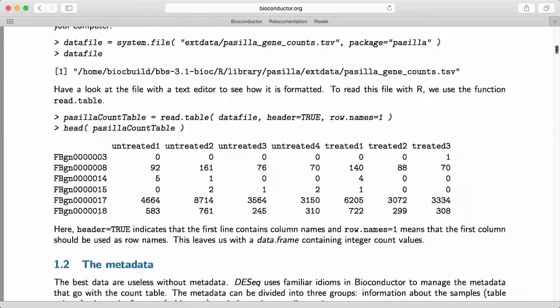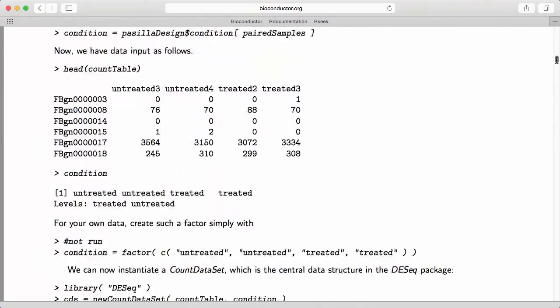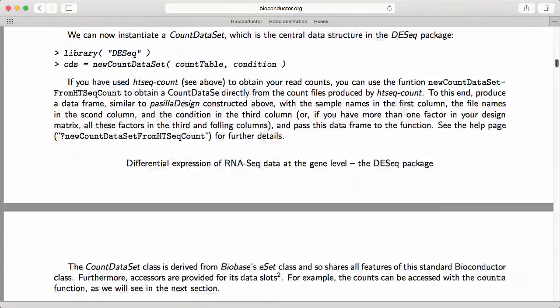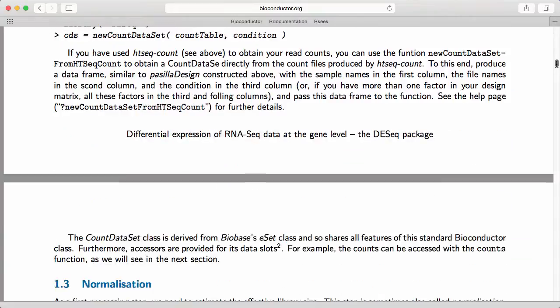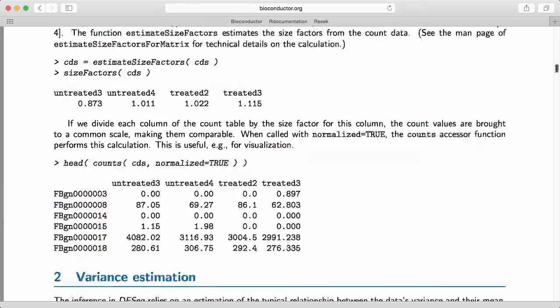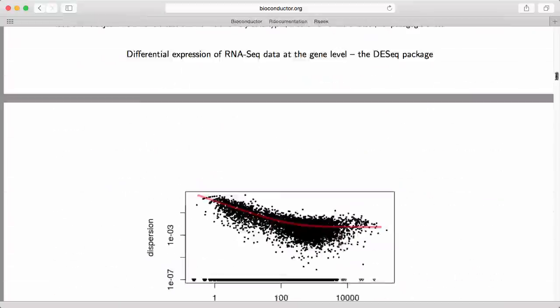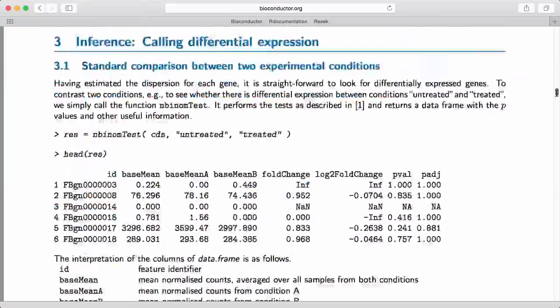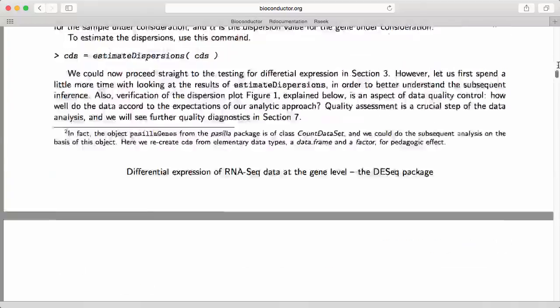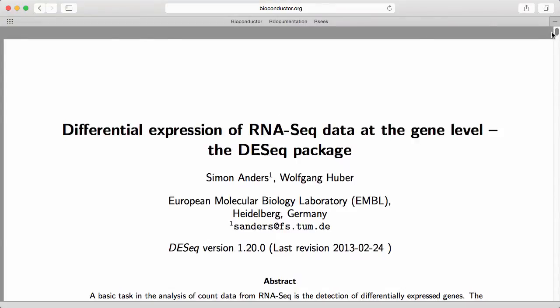Let's scroll down here. There's usually an example of an analysis on a specific data set, there's some plots and a lot of really useful information. This can be incredibly valuable and I would always encourage any user to start off by looking at the package vignette when they're using a new package.